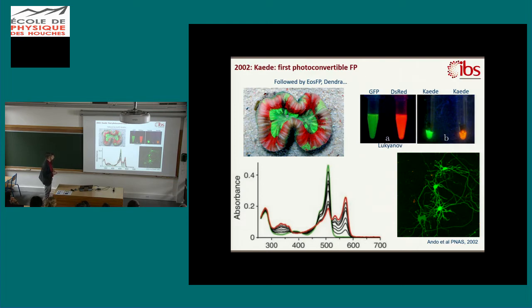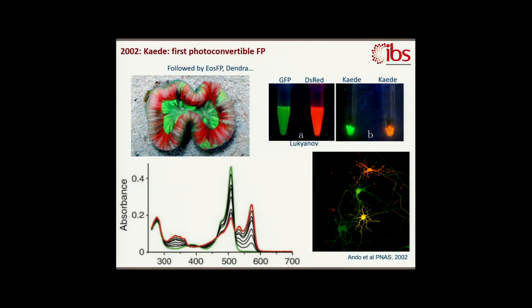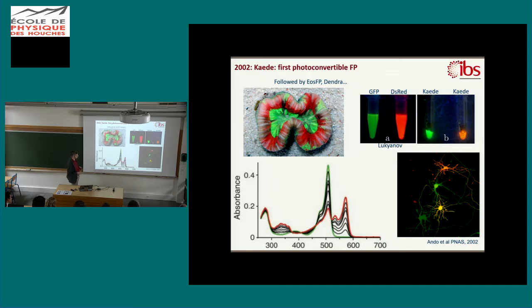And as Hideaki showed, you can have these neurons here that are indistinguishable in terms of network. And if you shine a lot on this one and a little on this one, then you can identify the different networks of neurons. So that's the photoconversion as seen as spectra in absorption. That's the green absorption of the anionic state, and that's the red forming in time. Note that you have an isosbestic point here, meaning that you have a one-to-one conversion.